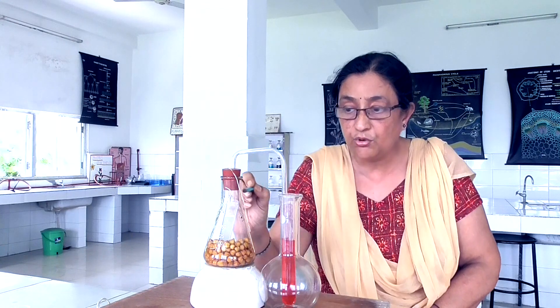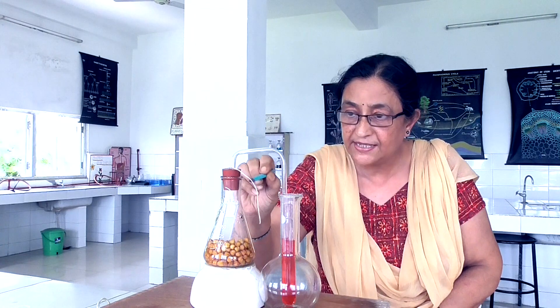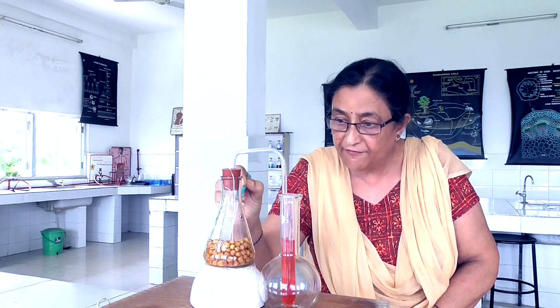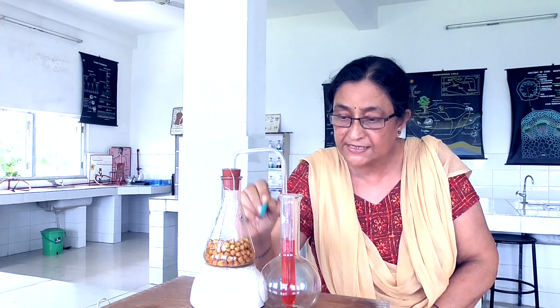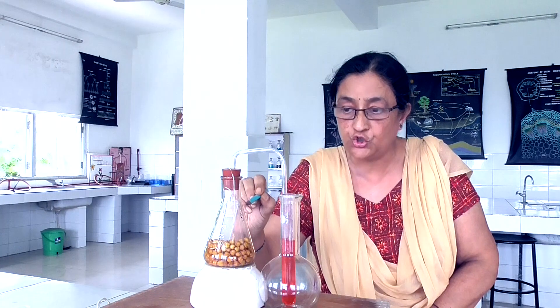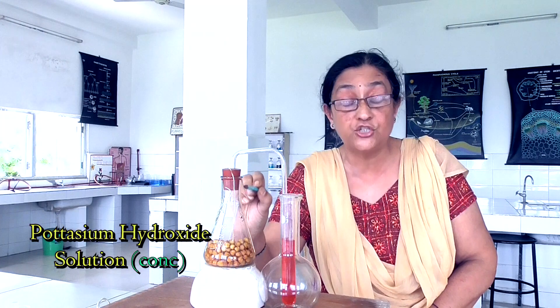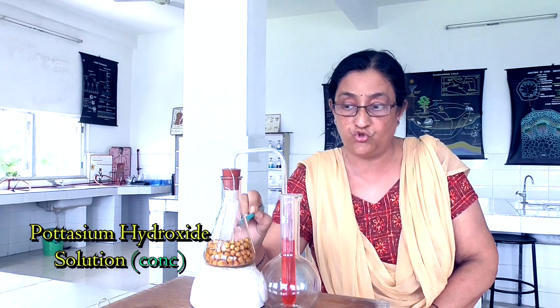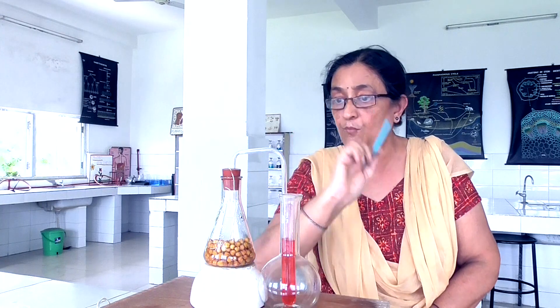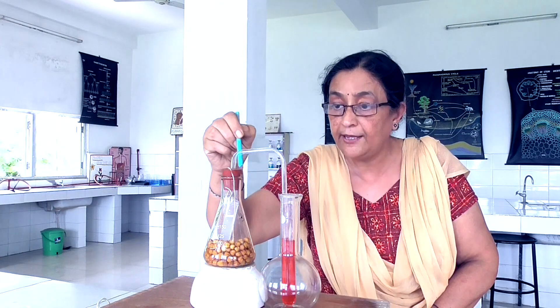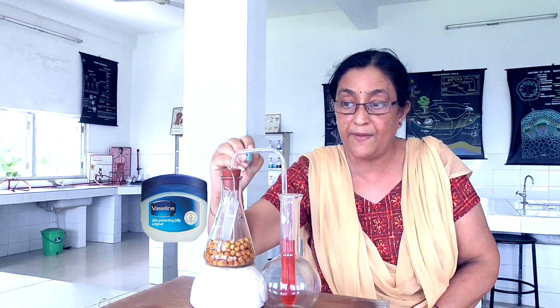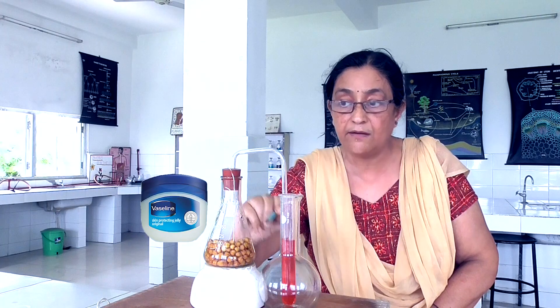One more thing you can see children — here you can see a thread, and with the help of this thread we have kept a small test tube inside the conical flask. In this small test tube, we are keeping potassium hydroxide solution — it is a concentrated solution. This is the experimental setup, and at this edge we apply Vaseline to make this apparatus airtight.